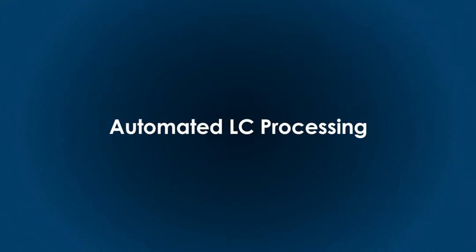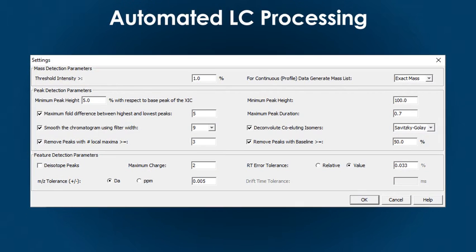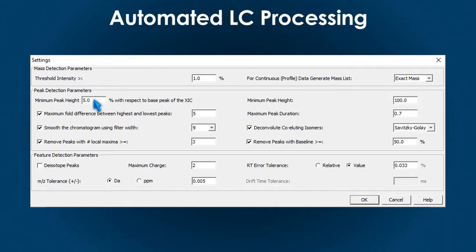Automated LC data processing. The software accommodates a robust LC-MS peak picking algorithm that efficiently creates candidate peak lists using the MS-1 and MS-MS data.